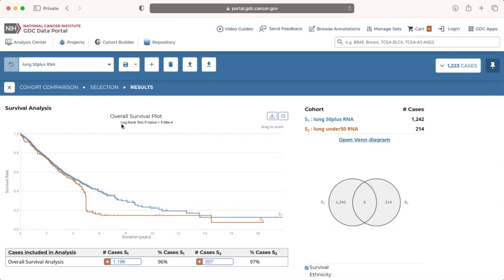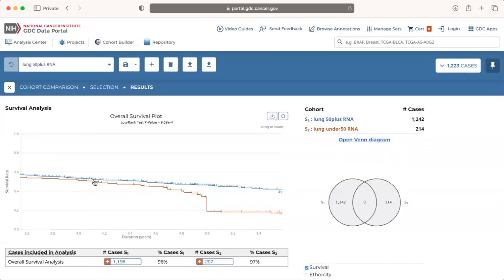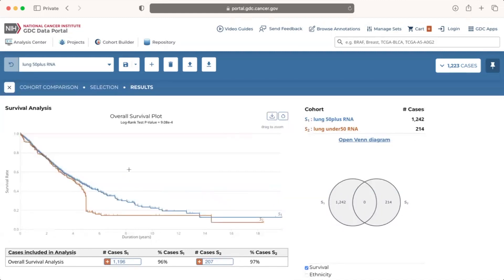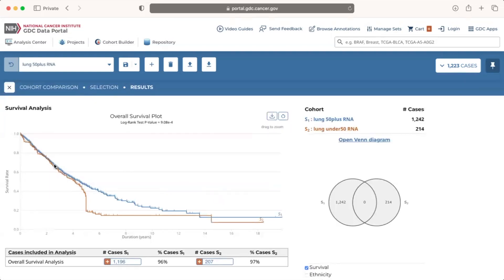To zoom into the survival plot, we click and hold and drag the crosshair to select the area to zoom into. We can reset the view by clicking on the blue cyclical arrow reset button in the upper right corner of the plot. We can also view specific case data by hovering the mouse over the survival curve to display case ID, survival rate, and time of death or interval of last follow-up.